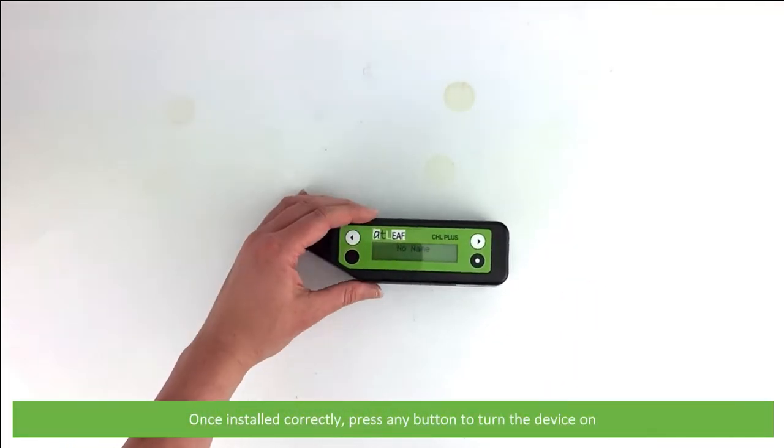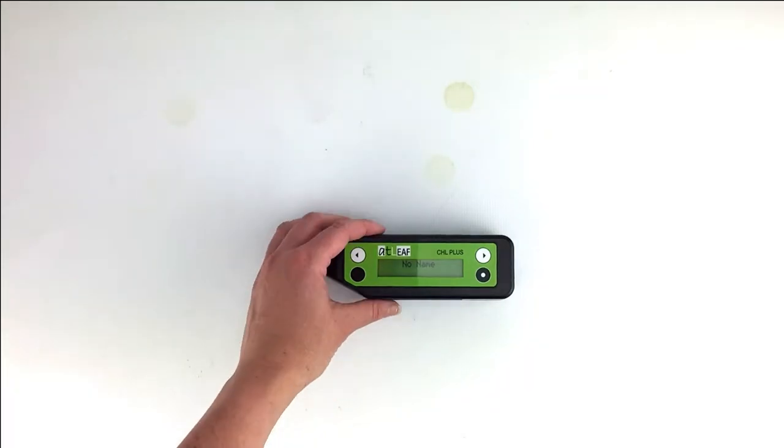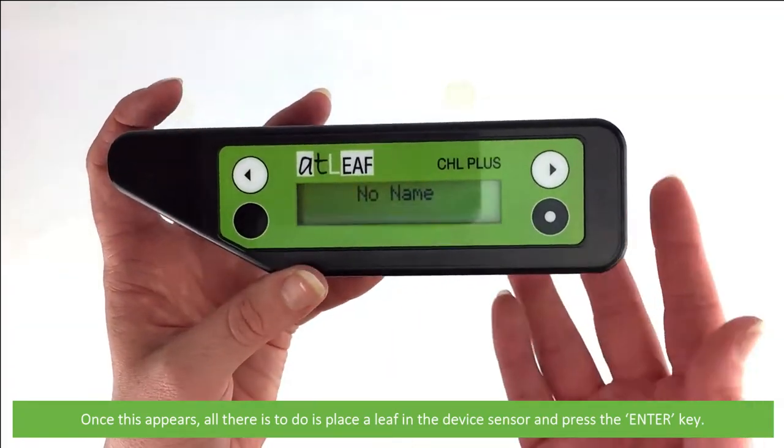Once installed correctly, press any button to turn the device on. After the device is powered up, the message 'no name' will appear on the screen. Once this appears, all there is to do is place a leaf into the device sensor and press the enter key.